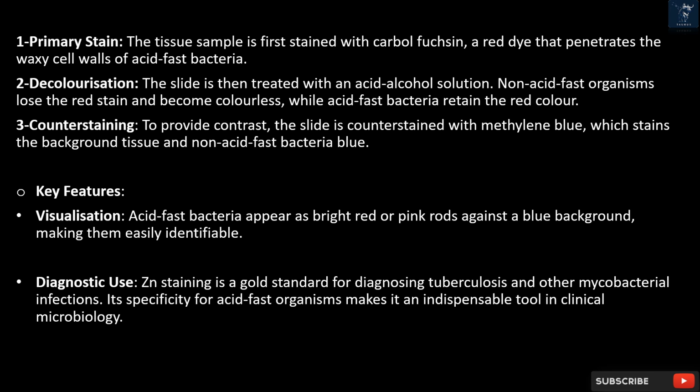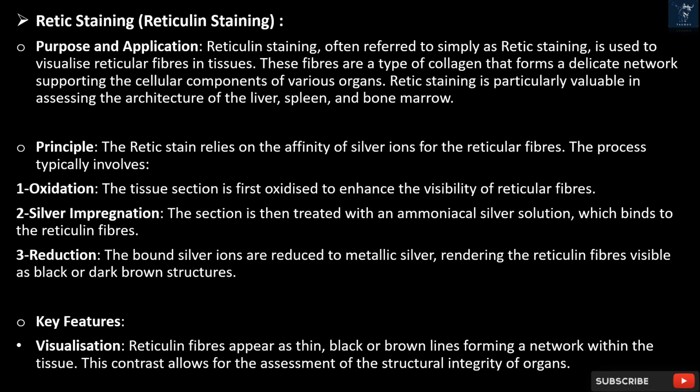Diagnostic use. ZN staining is a gold standard for diagnosing tuberculosis and other mycobacterial infections. Its specificity for acid-fast organisms makes it an indispensable tool in clinical microbiology. Retic staining, reticulin staining. Purpose and application.